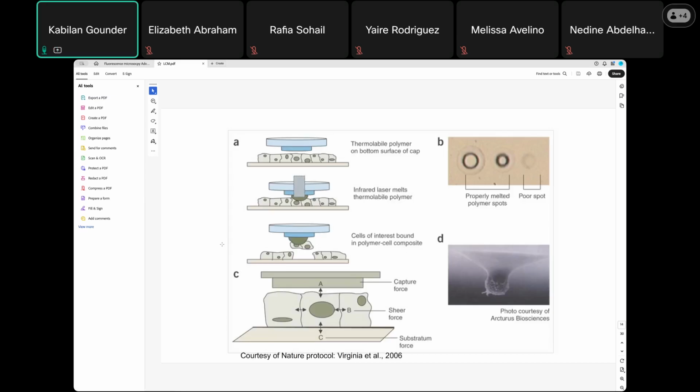So now, how are we going to isolate the cells? This figure shows the schematic steps of how we are going to isolate cells from heterogeneous mass. As we know, after you process your cells, fixation, dehydration, infiltration, embedding, then sectioning, staining. So now your section is on top of the slide, right? You transfer onto the slide, then you process.